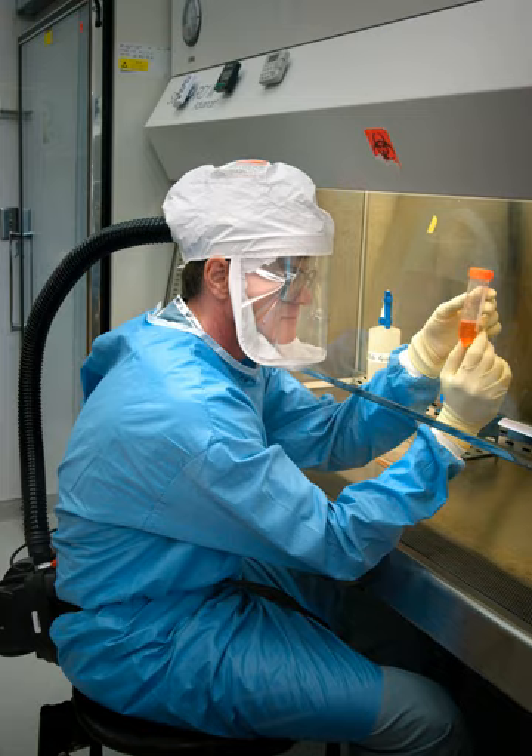As with work on open bench tops, work performed within a BSC must be performed carefully and safely. To avoid contamination and the risk of personnel exposure, the CDC advises investigators to follow best practices to reduce and control splatter and aerosol generation, such as keeping clean materials at least 12 inches from aerosol generating activities and arranging the workflow from clean to contaminated. In particular, open flames — not necessary within the clean environment of a Class II or III BSC — cause disruption of the airflow inside.